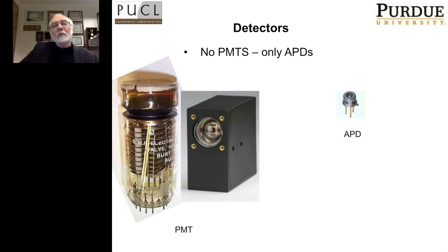and works very well. And there have been lots of developments in flow cytometers over the years. And on the right side is, let's say, a more compact version, one that's probably pretty standard on most flow cytometers. So this is what we have on our flow cytometers. And the reason is because photomultiplier tubes are very reliable, very sensitive, and they work very well.